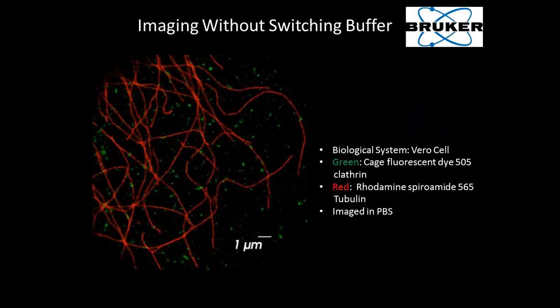And in terms of, if you're using these thiols and you're imaging live cells, how toxic is that? One of the things that people have harnessed is to be able to use things like ascorbic acid or glutathione that's already naturally present in the cell to act as a reductant. So there are some options there.